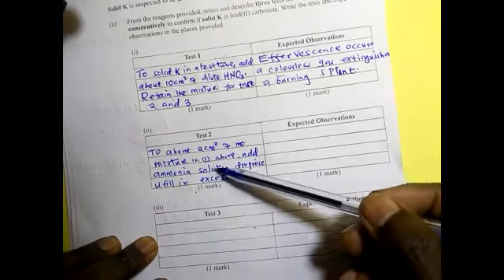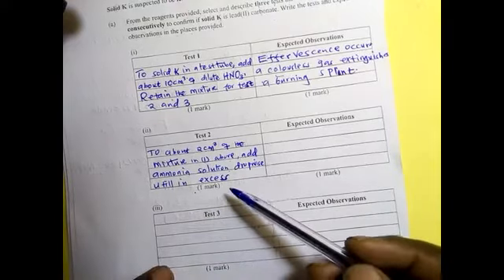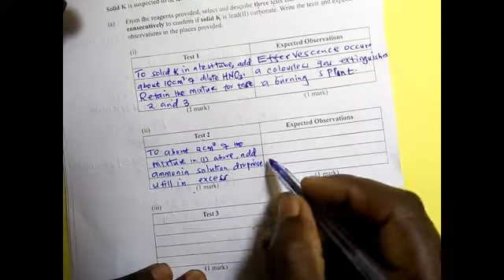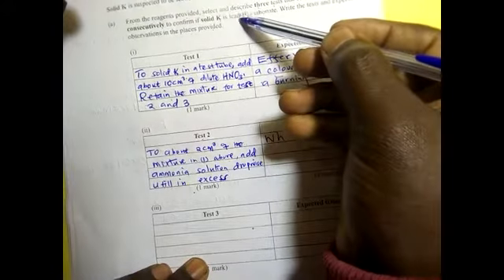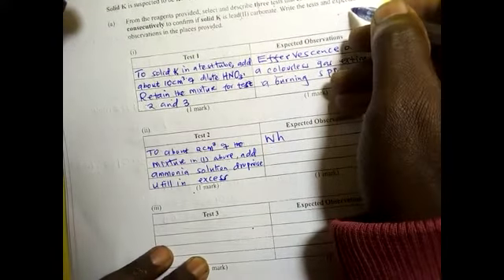But if it does not dissolve, then there are other ions inside, like aluminium. So here the observation is white, because we are suspecting lead, and lead is among the amphoteric.